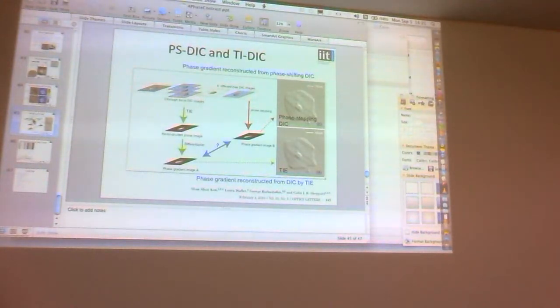And when you say higher spatial frequencies, would you see sub-resolution information? Like, would you see differences if the structure changed by 10 nanometers or something? Would you only see a smaller pixel? That's a good point. Or would you actually see? Good point. I mean, there has been this work, of course, where people have used polarization methods to get sub-resolution type information. Even in Ireland, I remember one of Chris Dainty's guys was doing that, wasn't he?